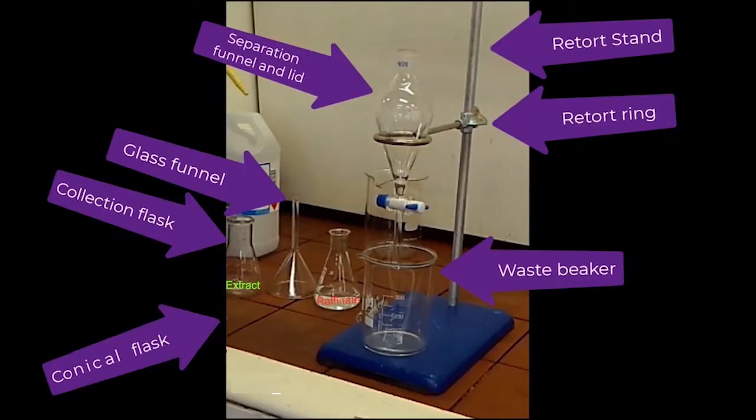Using a separation funnel is a good way to extract and wash organic products. To set up, you will need the following: a retort stand with a retort ring, a separation funnel of appropriate size with a lid that fits tightly, a waste beaker, a collection flask, and a conical flask.